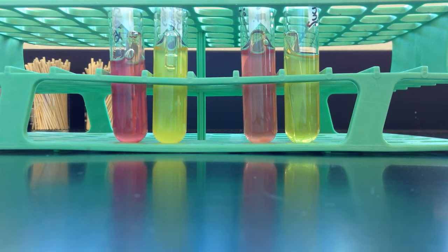Now the indicator here is phenol red. Phenol red starts out red, which you actually see here on the left. That looks almost like an uninoculated tube even though it's not. And phenol red will turn yellow if the pH drops when an acid is produced.